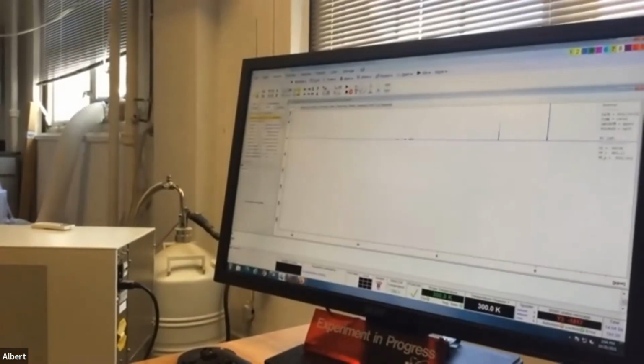Okay. So now, phasing is a part of the processing. So click that double arrow that's pointed up and down. Come on over to the right, right here. Click it, drag the spectrum down to the 0 right there.